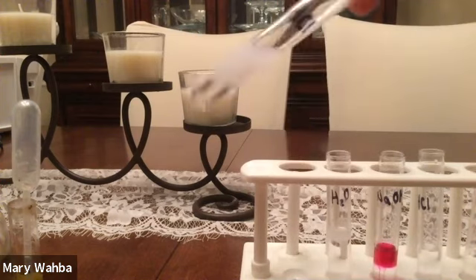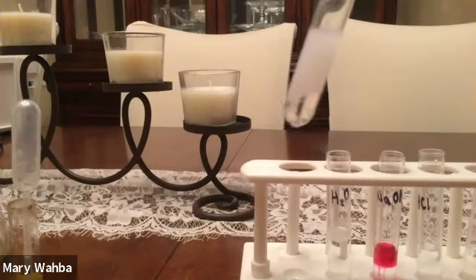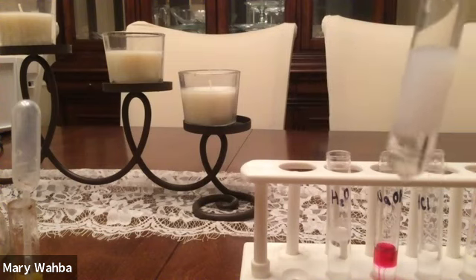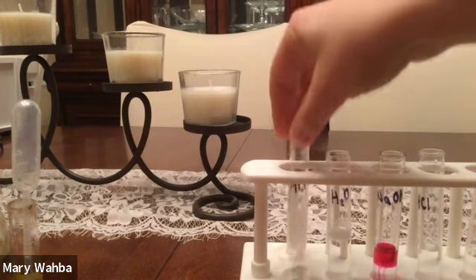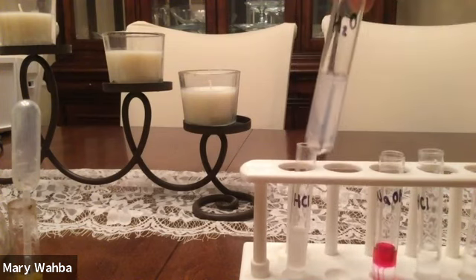So there's in the acid. It should remain colorless, or sometimes it turns a cloudy white like that. It's just turning cloudy white because phenolphthalein is dissolved in alcohol, and the alcohol is not really mixing with the water very well. But we can say it's a colorless solution.